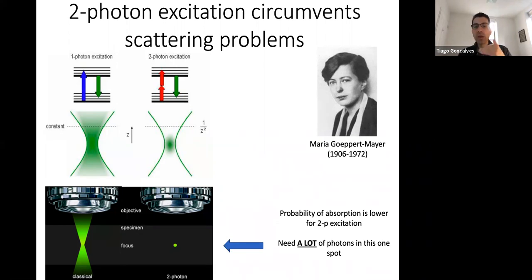So it falls quadratically with the z-square, but it will depend on your point spread function of your imaging system, because what you'll need to do is create this volume, which will be ideally the smallest volume, the smallest points that, if you're diffraction limited, your objective can image. So it will be approximately the point spread function volume.